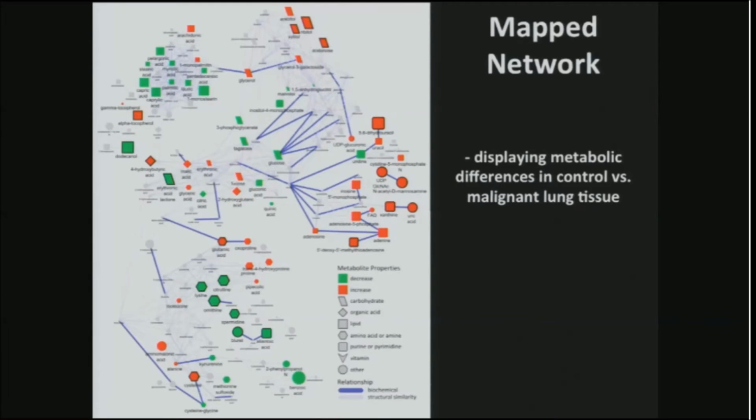If they're outlined with a border, well, these are biomarkers in a multivariate predictive model. Their shape tells us what biochemical domain they're coming from. If there is no color, well, these weren't statistically significant, and so they're kind of out of your way.